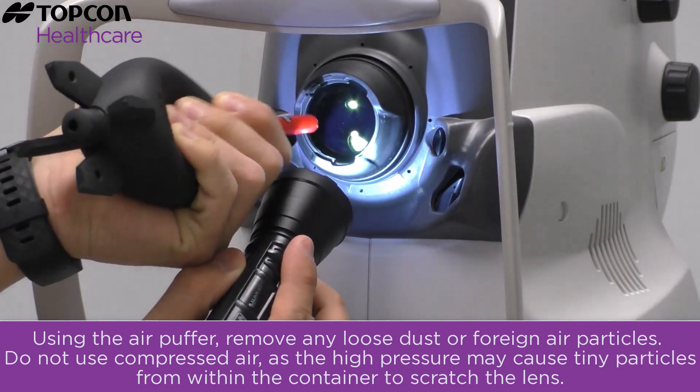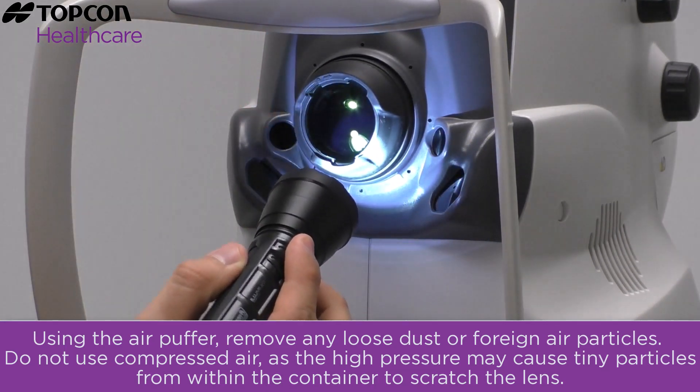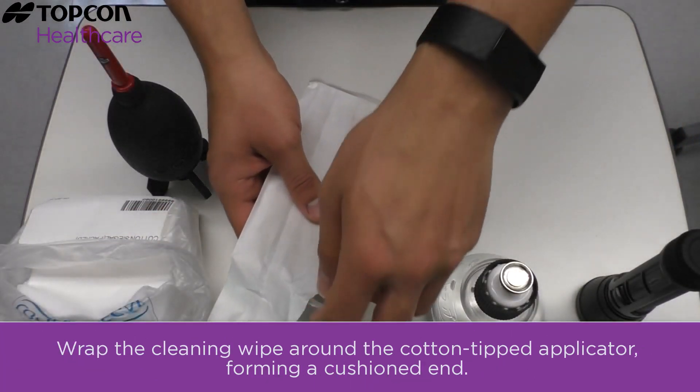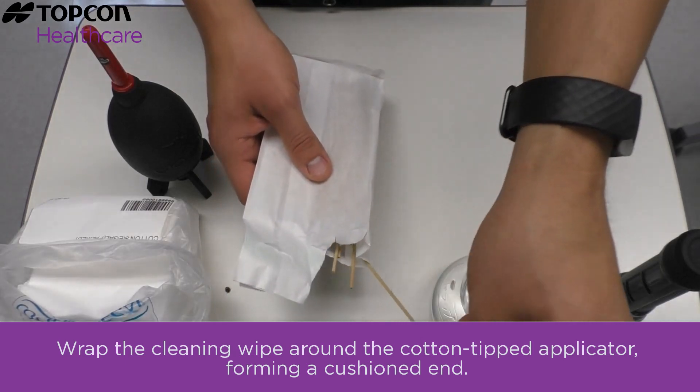Do not use compressed air, as the high pressure may cause tiny particles from within the container to scratch the lens. Wrap the cleaning wipe around the cotton-tipped applicator, forming a cushioned end.